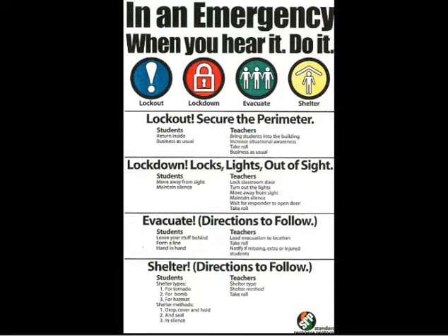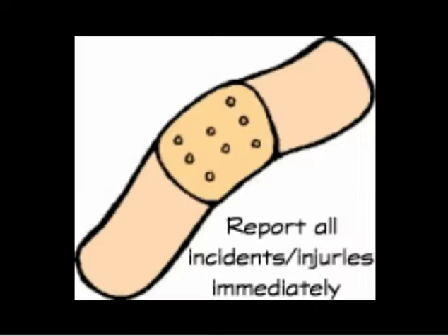And then we have the eyewash emergency shower. This is not in case you forget to shower and you're smelling bad. This is in case you get some chemicals in your eyes and you need to remove it. Notice that every room in this building has an emergency alarm. When you hear it, do it. So these are just different things that you need to know, and you'll be going over these a little bit more in TA so you know what to do if there's an emergency.